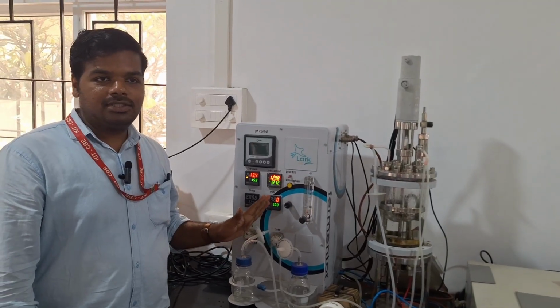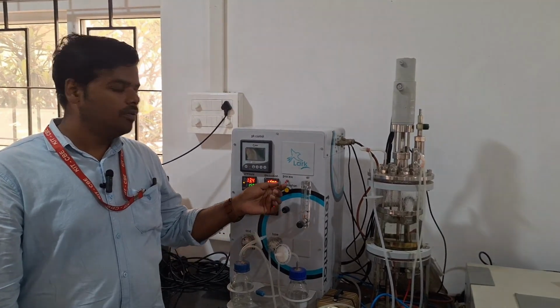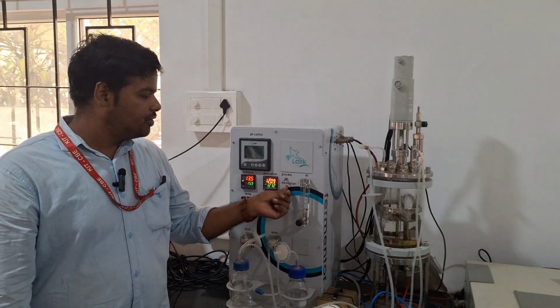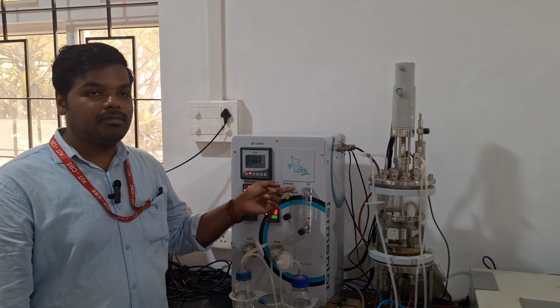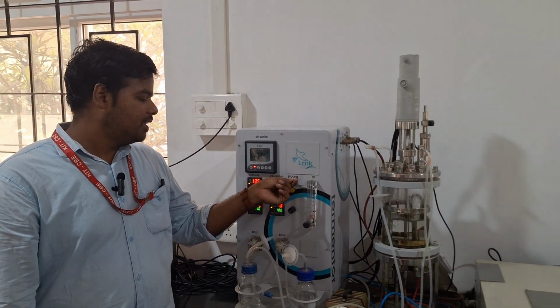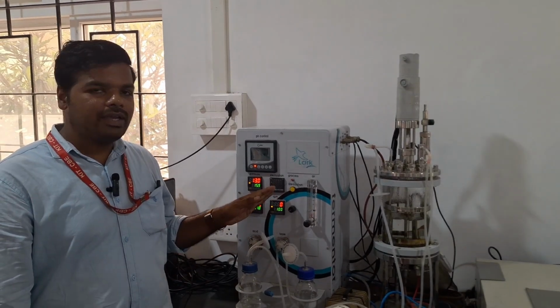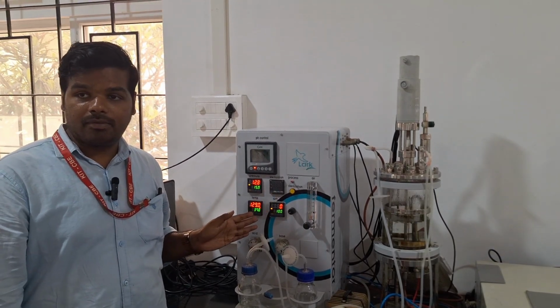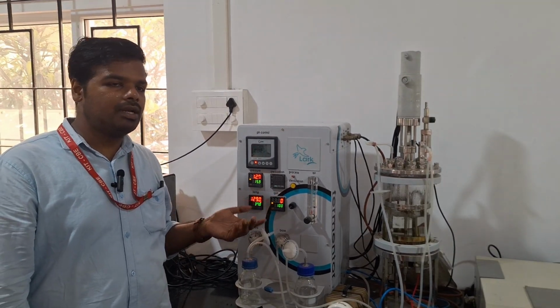The heating cycle is about to be over. When it reaches 121 degrees Celsius, we need to switch off the sterilization. Now we can see the temperature on the other panel, that is the temperature panel. There is a variation showing between the sterilization panel and the temperature panel, the process panel. So you can take the error term and reduce the temperature.